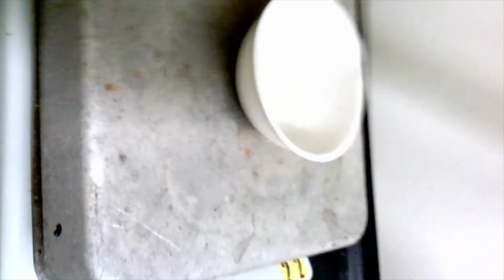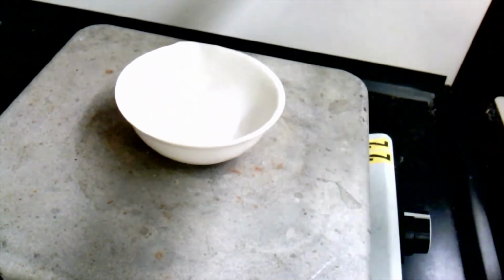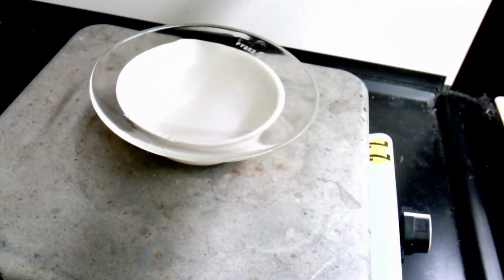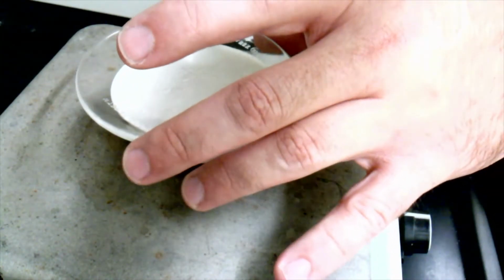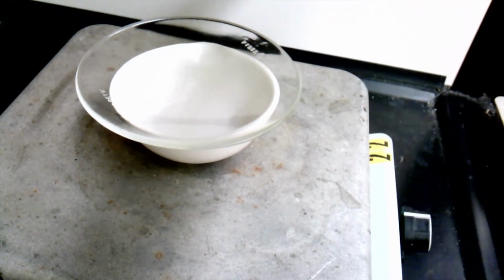and put it onto a hot plate. Okay, can we see this? Maybe we're upside down, but we can see it. I'm going to put it onto a hot plate. I'm going to cover it so that if it's boiling very vigorously, I don't lose any of my product, because I need to know the mass of my product very, very reliably. So we're going to let this thing do its thing for a while.